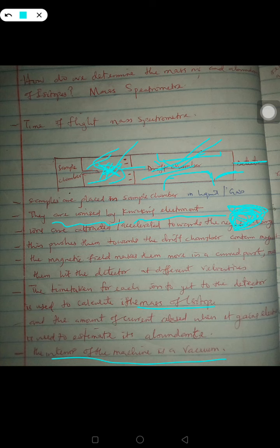Number two, to also ensure the movement of electrons easily, because electrons or electromagnetic waves only move through a vacuum. That means they move through empty space. They don't need a material medium for their propagation. A very good example of it is the sunlight reaching the earth. It moves through the vacuum. It doesn't have a connector between the sun and the earth. It just radiates. That is an example of a vacuum.